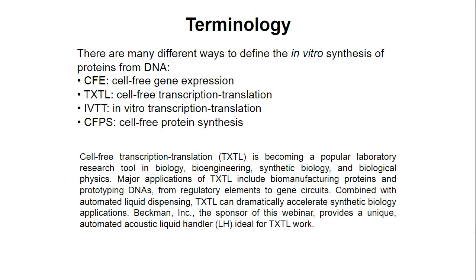Let me start with some terminology. There are many different ways to define the in vitro synthesis of proteins from DNA: CFE for cell-free gene expression, TXTL for cell-free transcription translation, IVTT for in vitro transcription translation, and CFPS for cell-free protein synthesis. As described in the paragraph below, cell-free transcription translation is becoming a popular laboratory research tool in biology, bioengineering, synthetic biology, and biological physics.